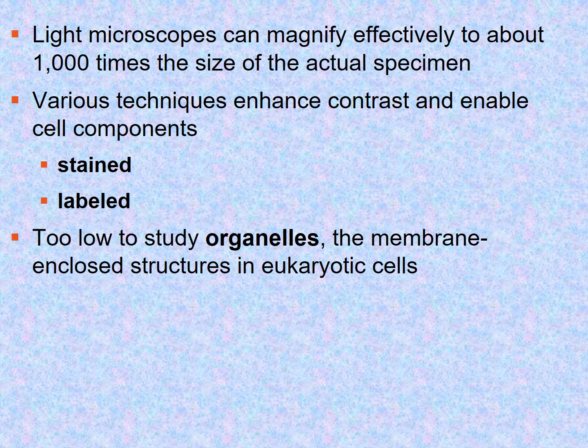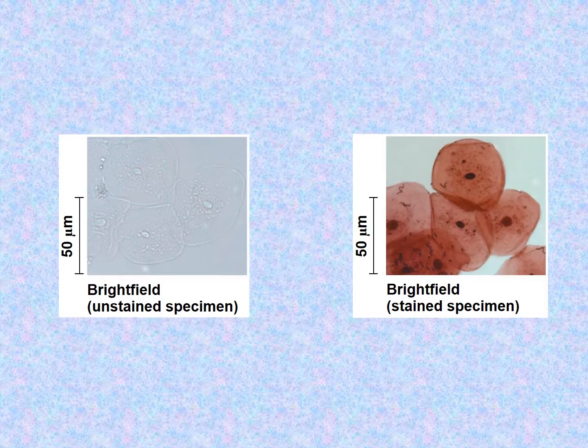Now, let's look at some different types of microscopes. This shows a light microscope here, and this basically compares an unstained specimen and a stained specimen. You can see the contrast is greatly improved with a stained specimen versus an unstained. You can imagine this would be very difficult to find if you were looking at this. It looks like a representative animal cell. Often cheek cells are used. But when you stain it, you can easily see, and you can see they're overlapping right here. You can see the nucleus a lot better than you can see it over here.